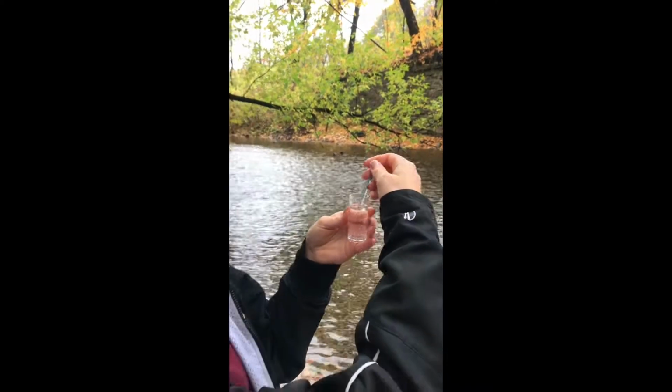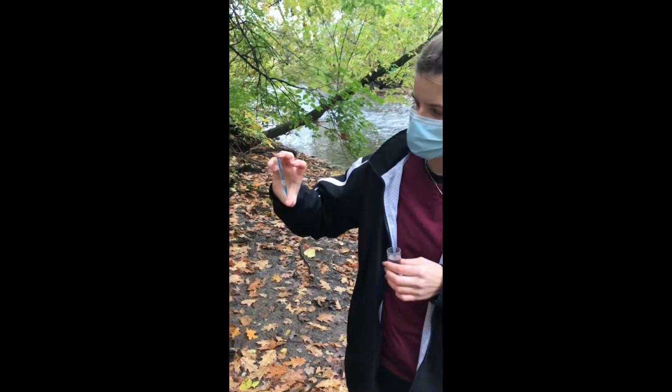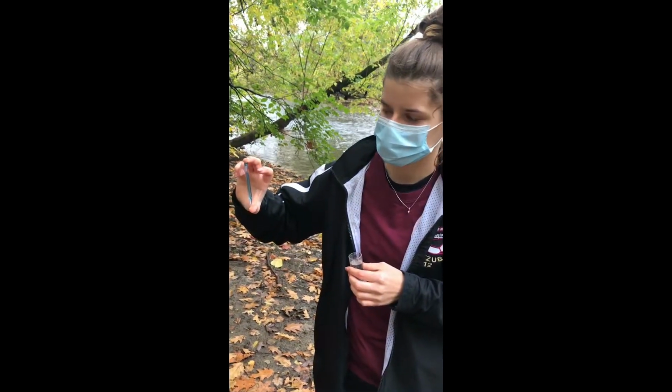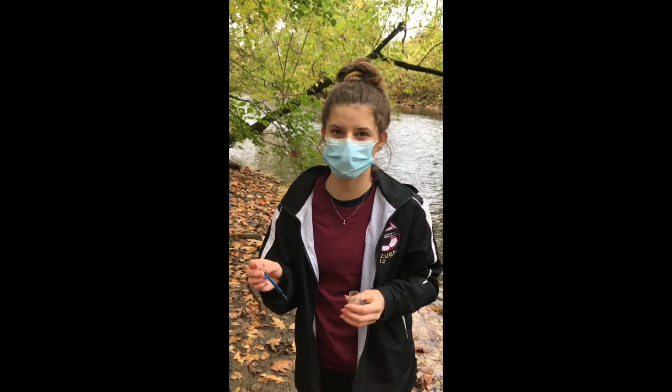Once you have done that, you're going to tip the ampule back and forth, letting the bubble float from the top to the bottom, mixing the stream water and the substance that was in the ampule. After you've mixed the ampule a couple of times, you're going to let it sit for 2 minutes, allowing the reaction to occur.